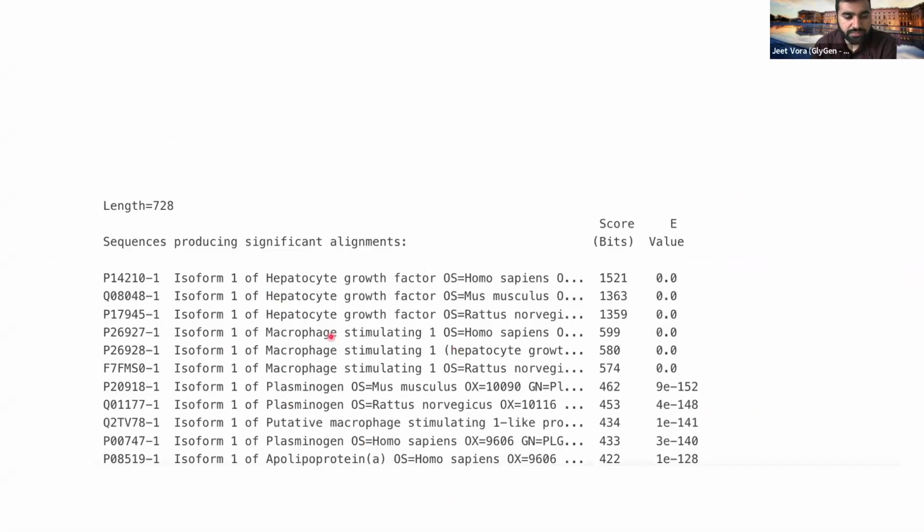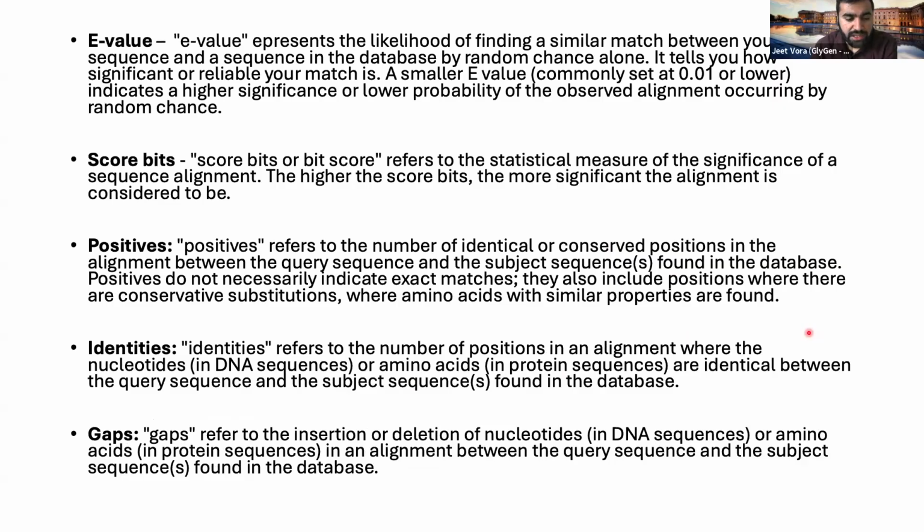You have the isoform, which is the canonical isoform, because canonical is part of the isoform of the protein entry. Then the UniProt accession, the protein name, or the protein header for the sequence. Then you have the bit score and the e-value. You can download it, filter it, and play with it to get the best match or to select the sequence of your interest.